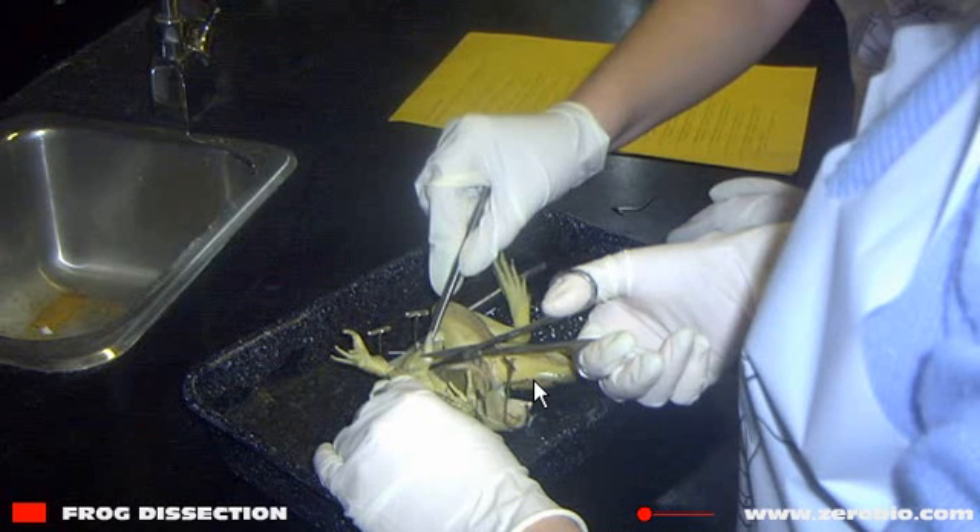Finally, in this image I want to point out the dissection scissors, which you'll be using. You won't be given scalpels, so use the scissors to cut through the skin. You've also got another piece of equipment here, which is a dissection probe.